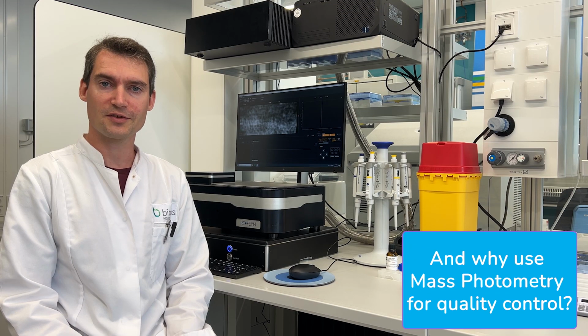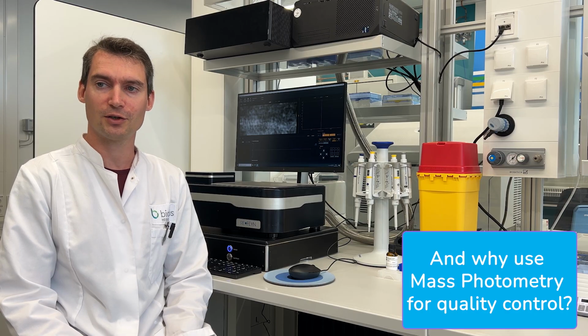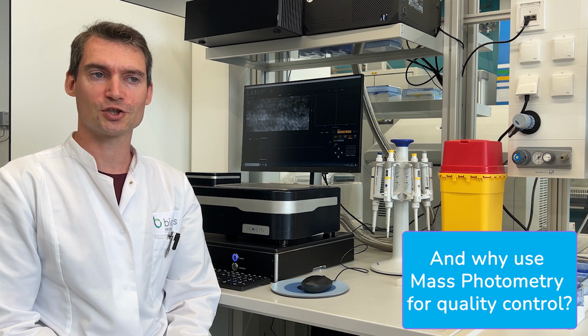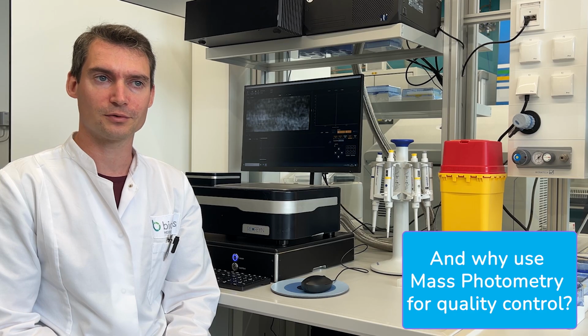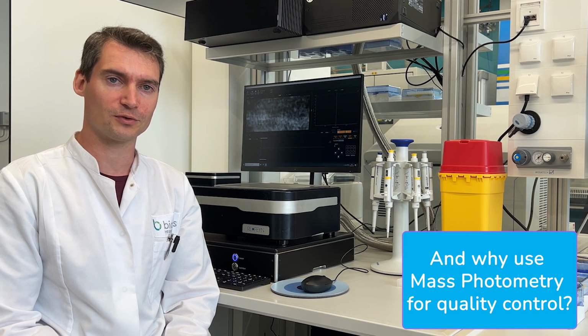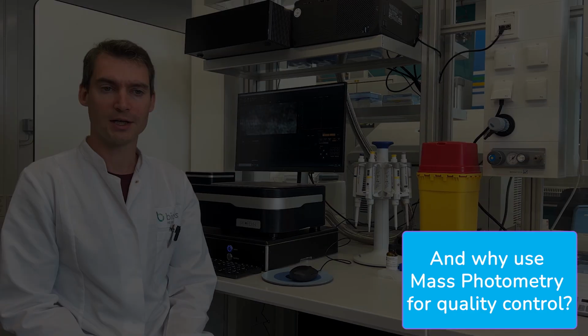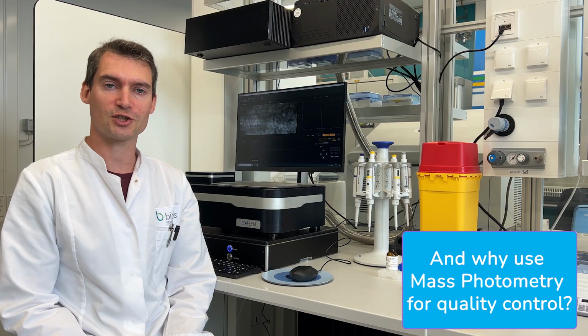One reason for it is that it is fast. So if you have a proper warm-up time planned into your day, you can just within about 5 minutes find out what your sample consists of. The second advantage is sample amount. So for even an analytical size exclusion column, I will have to inject at least 5 to 20 times the amount I would have to use on the TwoMP. And third is that the precision actually is better.